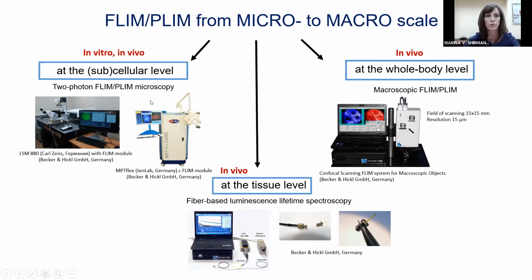laser scanning microscopy, you have subcellular resolution, and this method perfectly works for in vitro cellular studies and in vivo, and even in patients if you have a system like a microscope with a flexible arm. This is already in clinic.